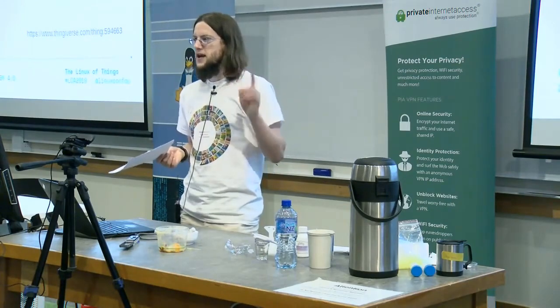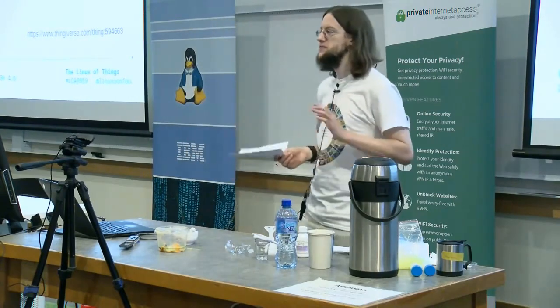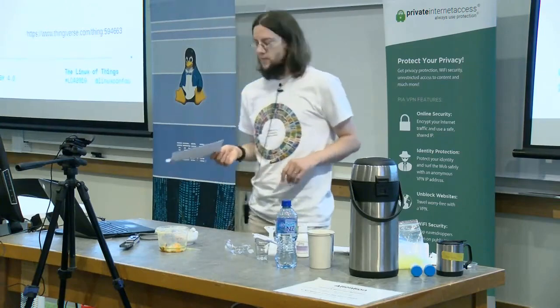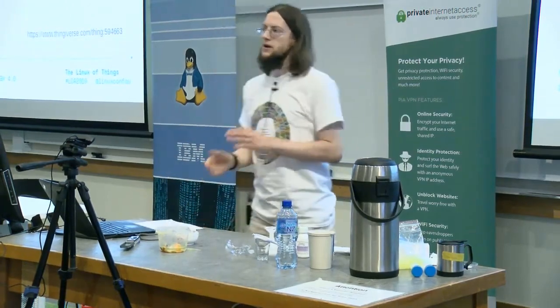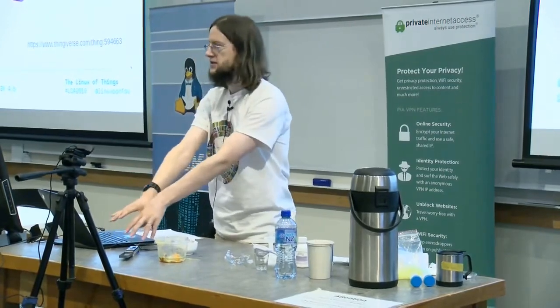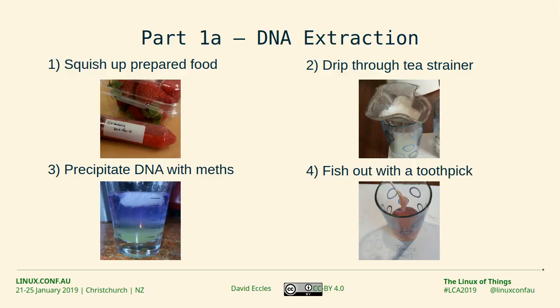Now, for those who haven't read my abstract, what I'm going to do is attempt a full workflow of DNA sequencing, from food to figures. In preparation for this, before I started my talk today, I prepared this flow cell that's sitting right here on the DNA sequencer and warmed it up a bit. Okay, here we go. On this slide are my instructions. What I'm going to try to do is extract DNA from a food that I got at a cafe on campus. This was my lunch from yesterday. Right. Let's get to it.